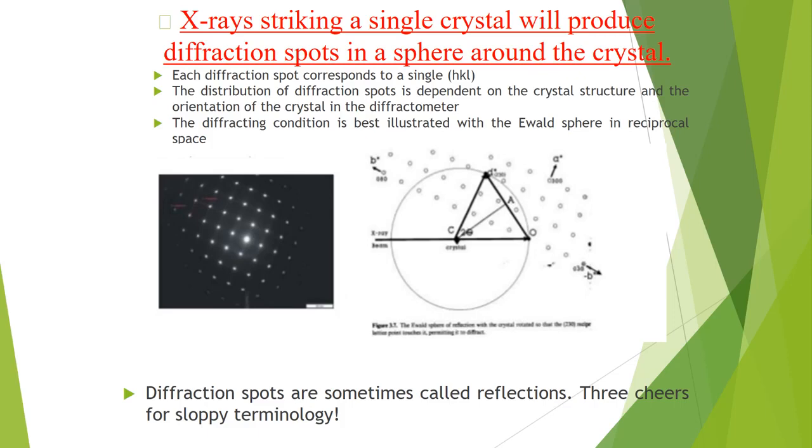So in the figure we can see different kinds of diffraction patterns that can be recorded on the film, and by these diffraction patterns we can find out the HKL values that depict the Miller indices, and these Miller indices are the planes of the crystal system.